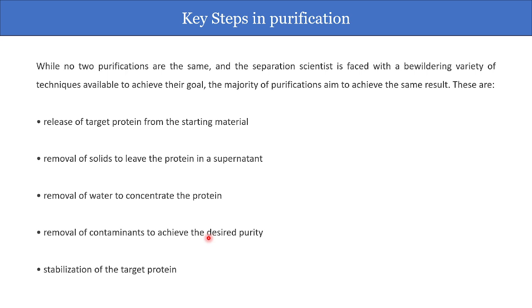Now, there are a few key steps in this purification process. No two purifications are the same, and the separation is faced with a variety of techniques, and you can use any one to achieve the goal.